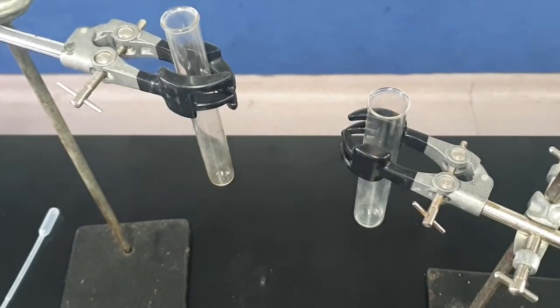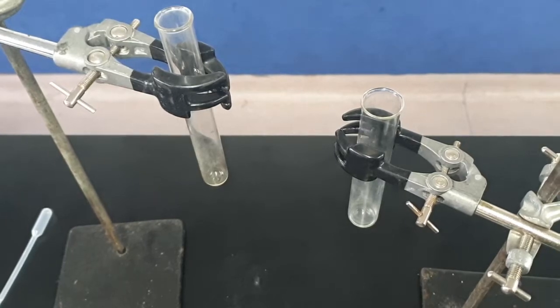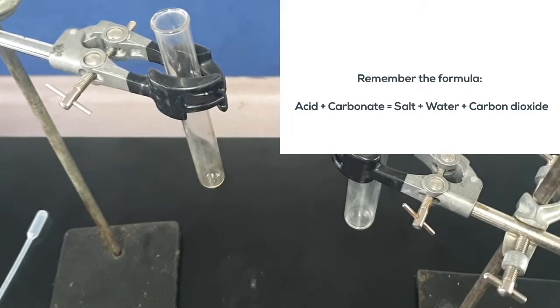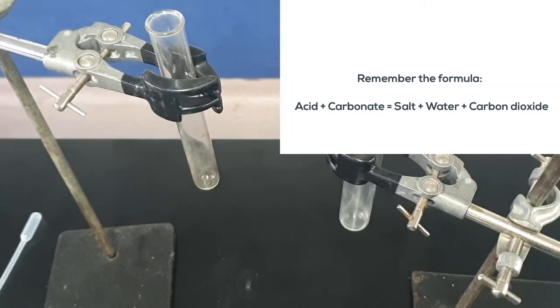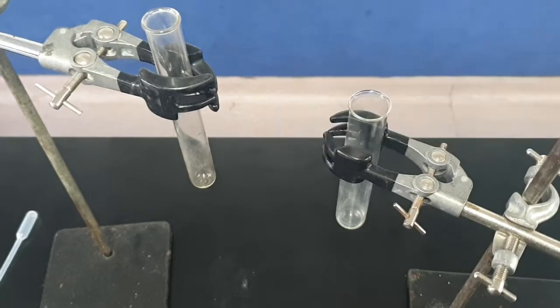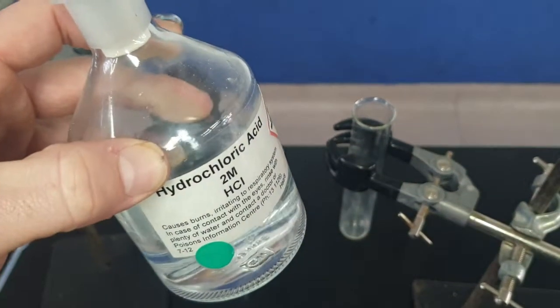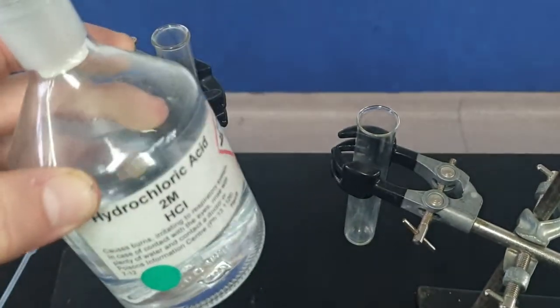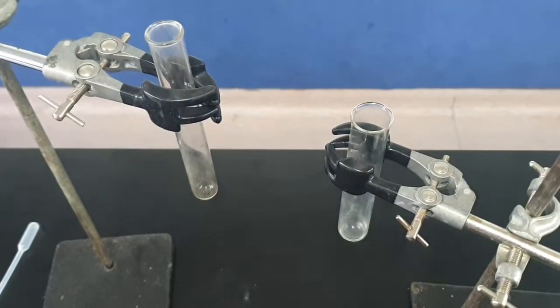With our acid and carbonate reaction, we are going to just take a quick look at the formula. As you can see, the acid and the carbonate are going to produce a salt, water, and this time carbon dioxide. And that's what we're going to identify in this demonstration. So the acid that we're going to be using is hydrochloric acid, and it's 2 molar, so it's a little bit more strong. It's going to give us a more rigorous reaction.